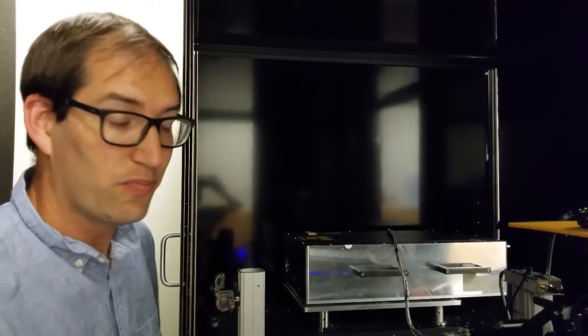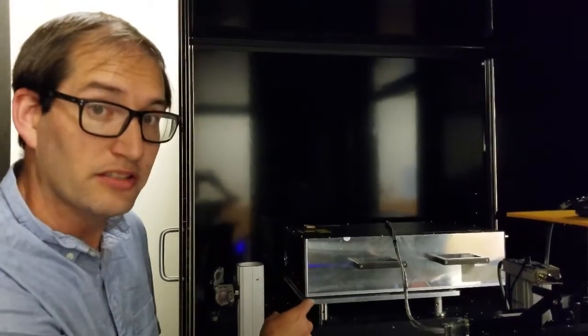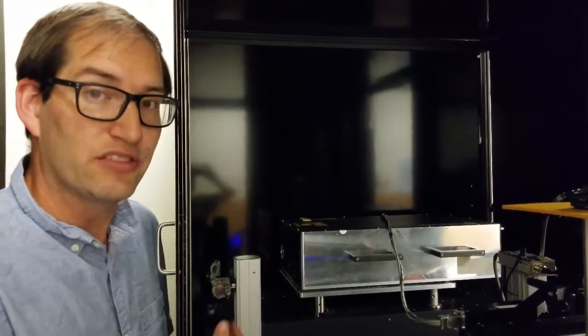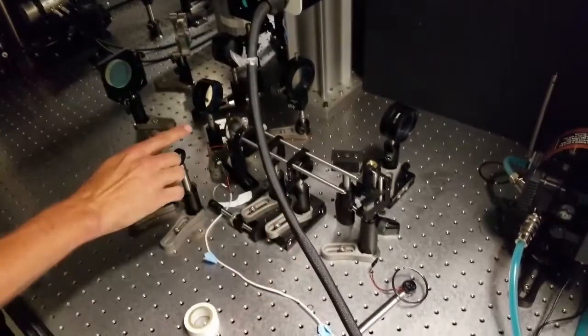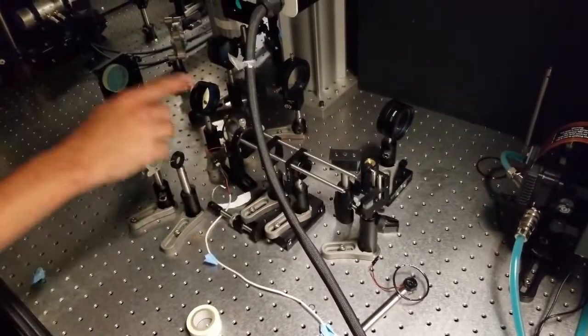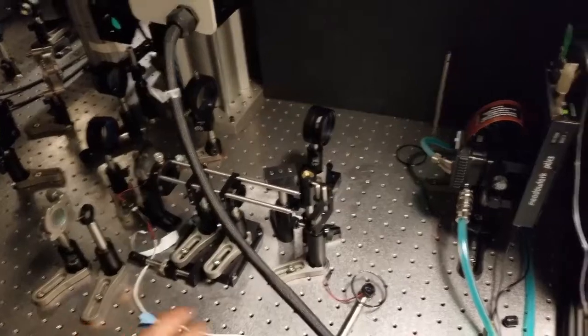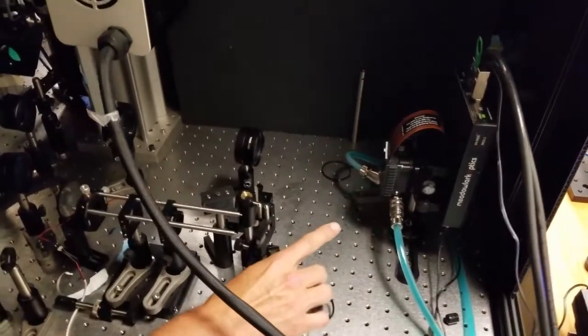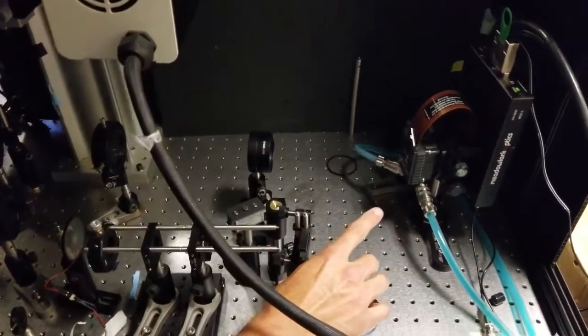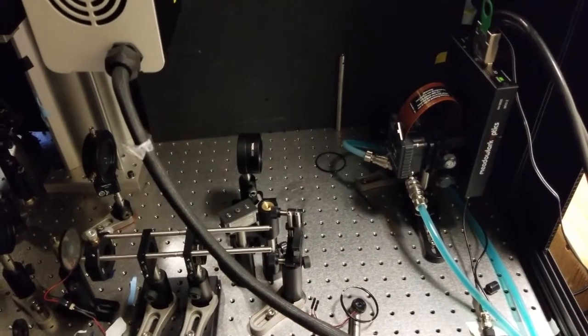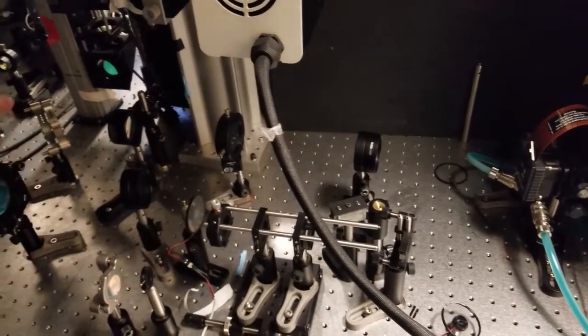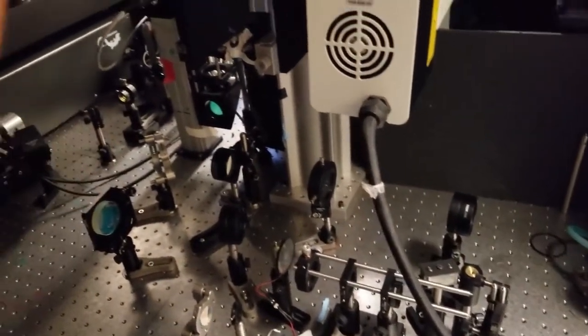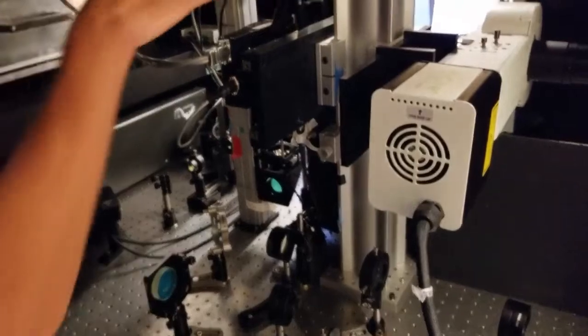So here's the back of the microscope. We have a high-powered 1040 nanometer laser that provides the light that will stimulate each of these cells. Then we have a bunch of optical elements to shape the beam. We have a diffraction grating, a spinning diffuser, and a bunch of lenses that will shape the beam exactly how we like. Then we come over here, and we reach the beating heart of the microscope, the spatial light modulator, which turns that light into a bunch of different points, which will each target independent cells. This bounces through the path again and merges with our imaging path inside the head of the microscope.